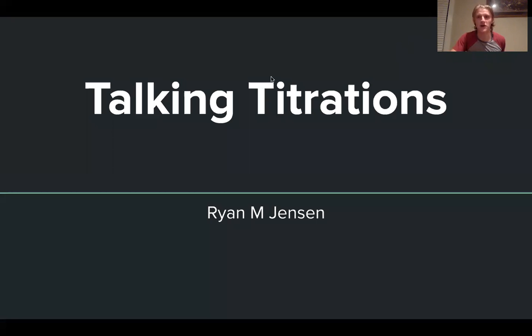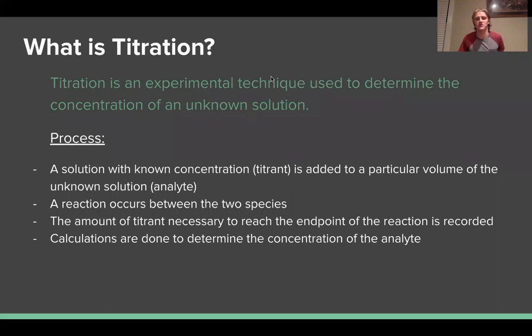All right, today we're going to be talking titrations. So what is a titration? A titration is an experimental technique used to determine the concentration of an unknown solution.